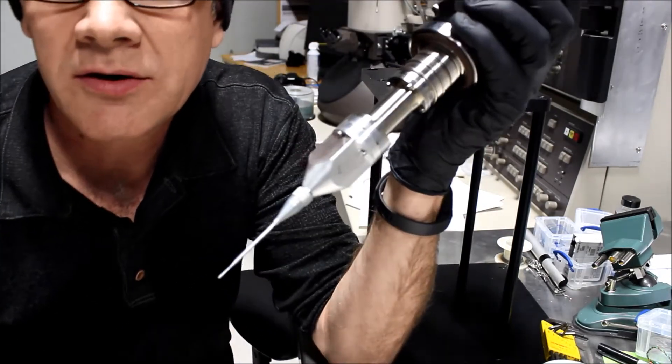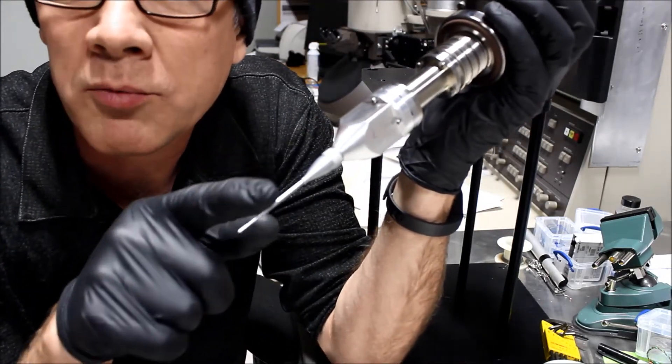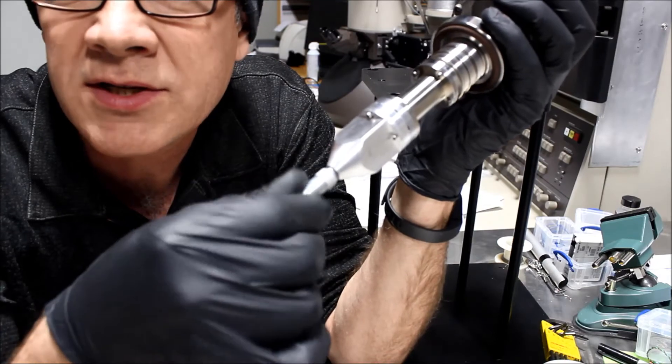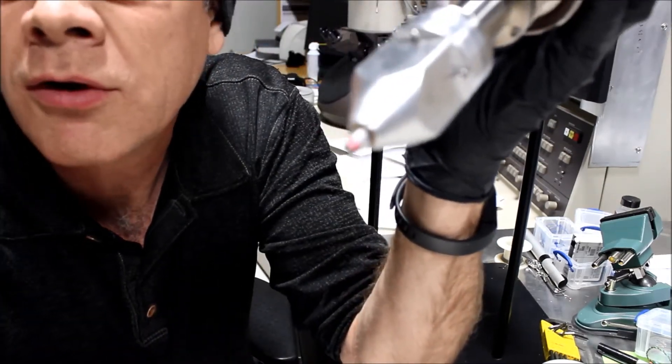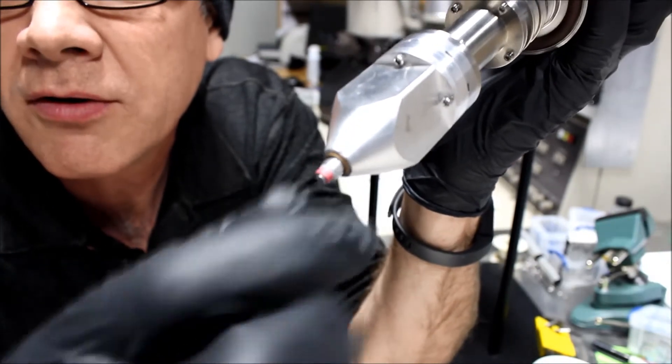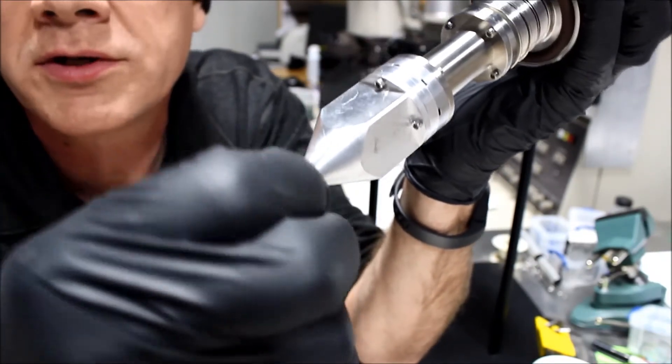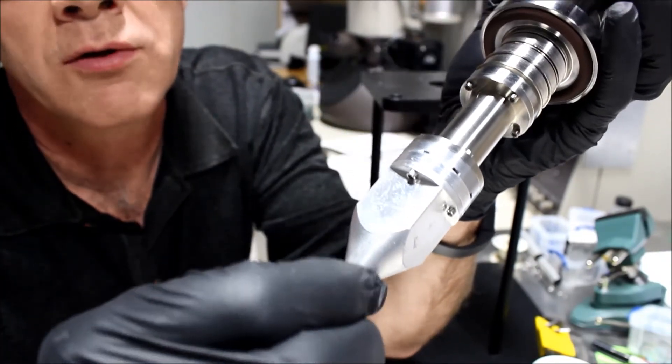Now on this end we can remove the needle. Okay, that's easy enough. Now we can remove the little flow control aperture on the end, turning that counterclockwise, and we don't want to lose the little washer that holds it there.